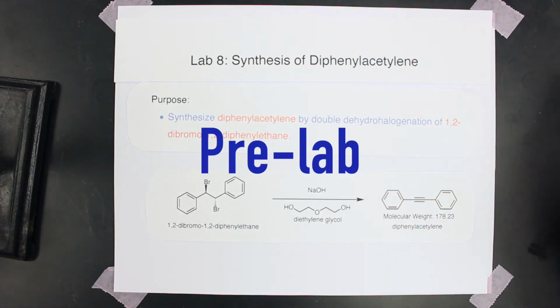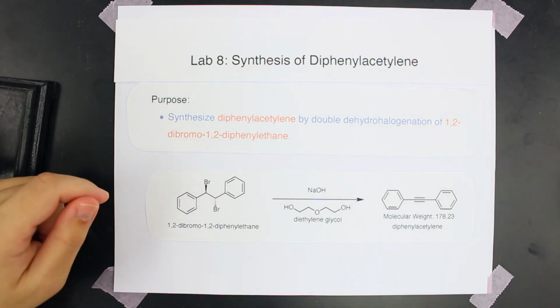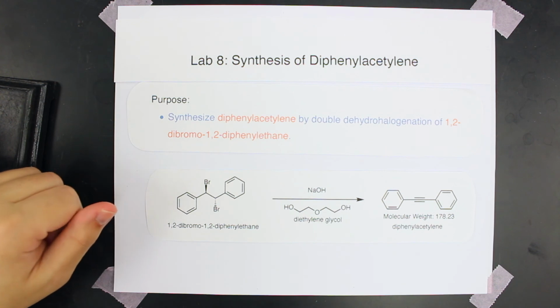Alright, hello everyone and welcome to Lab 8. This is the final lab for the fall 2020 semester, and this week we're covering the synthesis of diphenylacetylene.